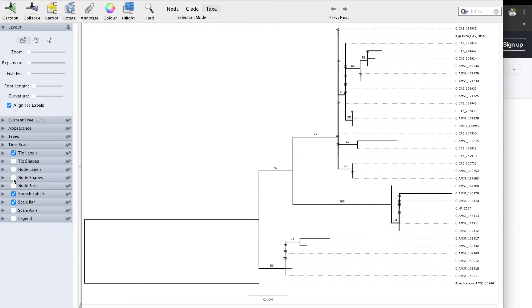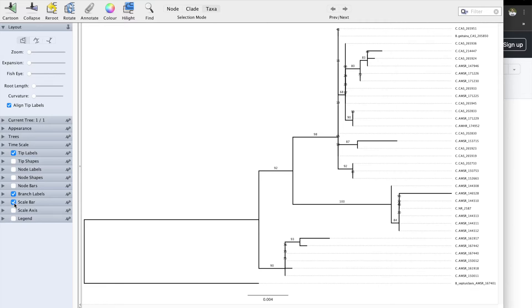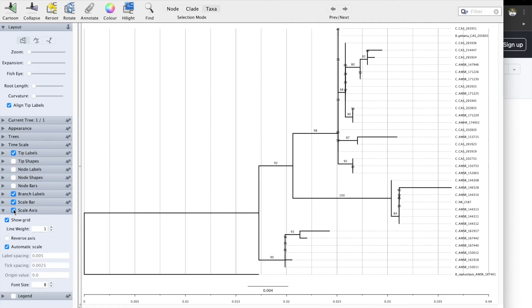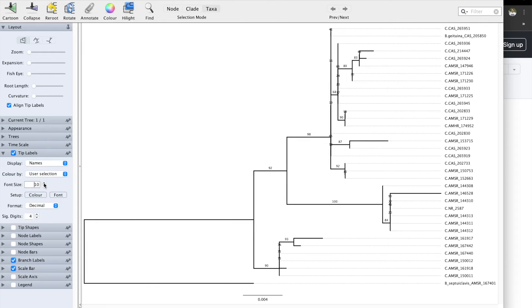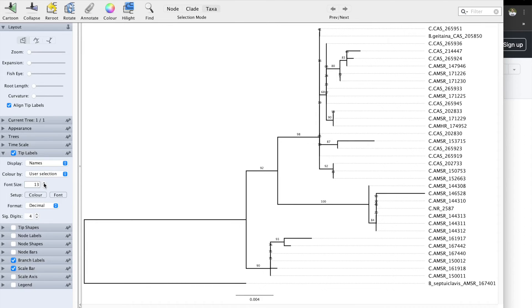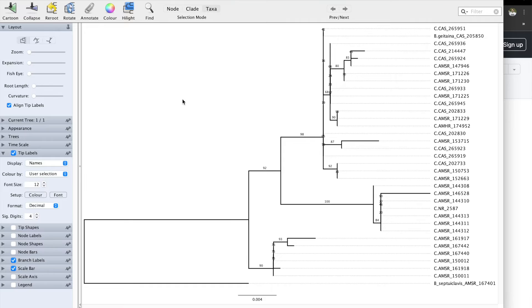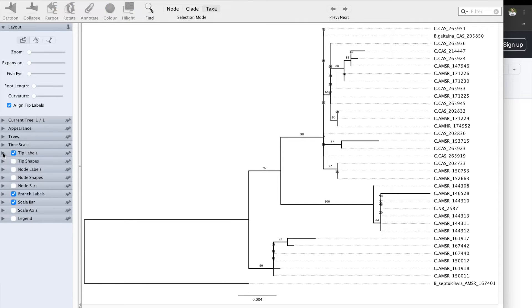Node shapes we don't use. Node bars we don't really use. Node labels, I already showed that. Scale bar you should be using. Scale axis — again, you need to have a reference to use this. Tip labels — let's increase the size of these. And that's already looking a lot better.